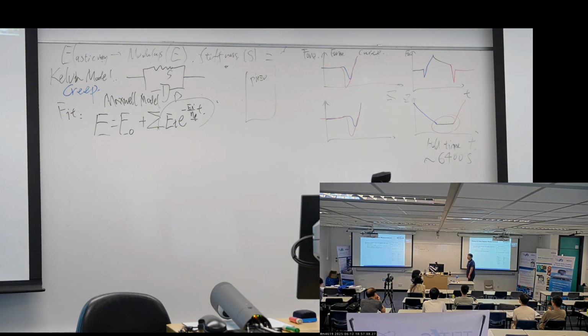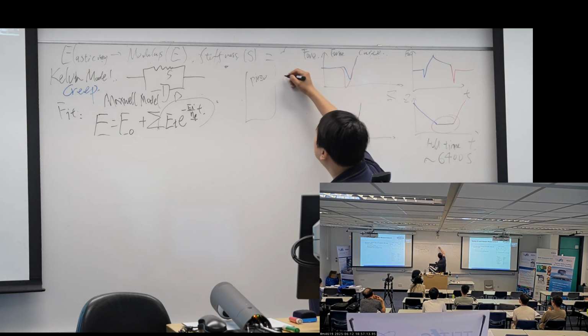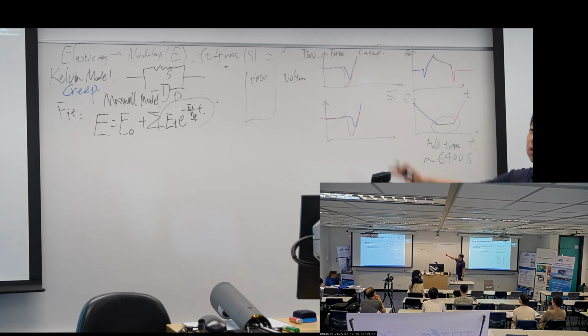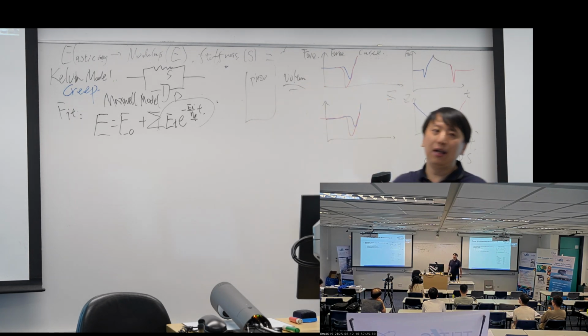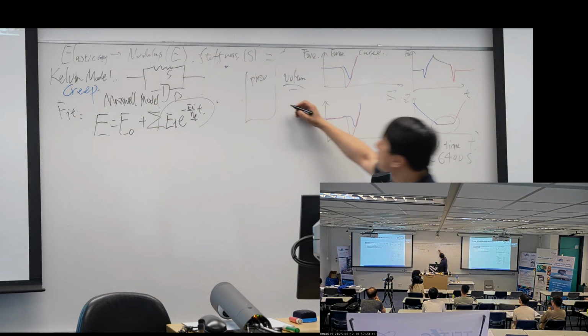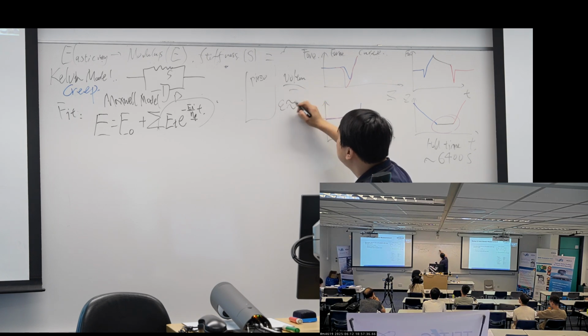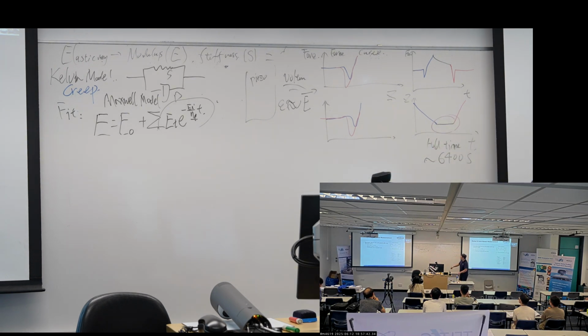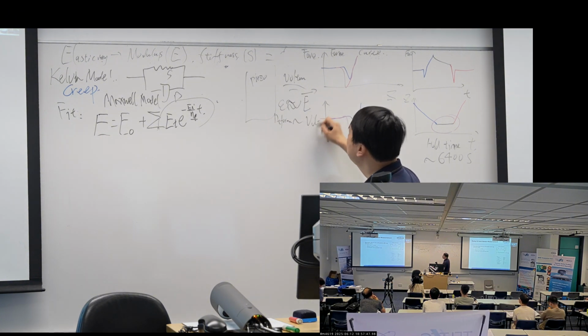It has piezoelectricity, which means if I apply a voltage on this material, the crystal structure will change under the applied electric field. So it will have a deformation, which in its terms is strain. Strain is proportional to the electric field applied. Written as deformation, the piezo deformation will be proportional to the voltage I applied.